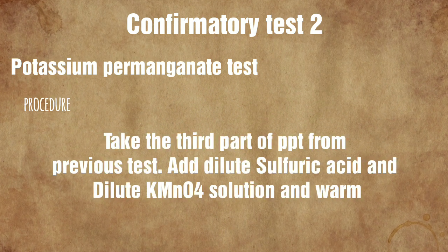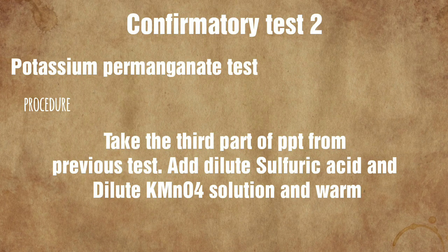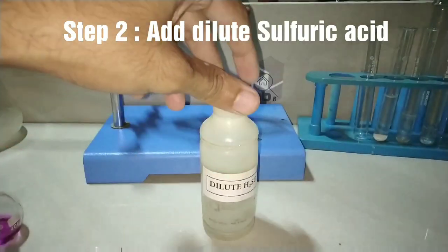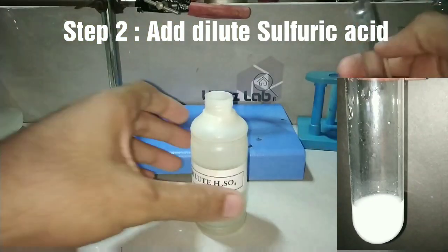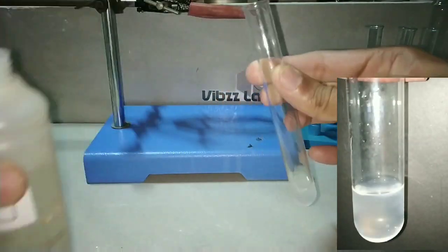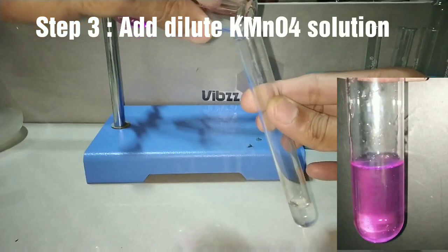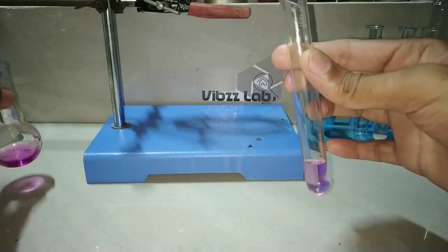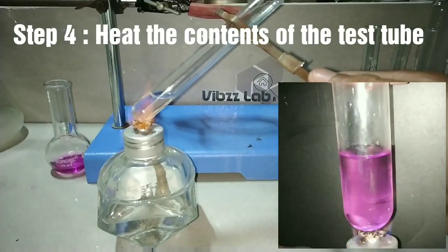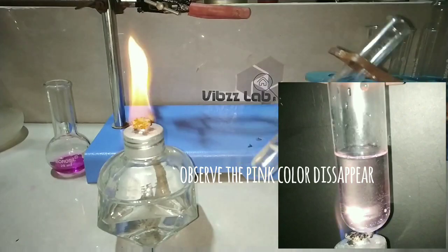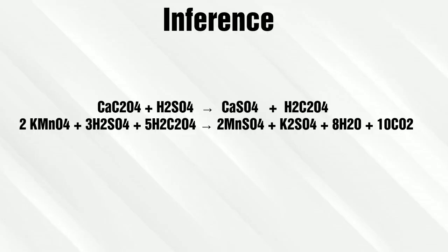The potassium permanganate test: we take the third part of the precipitate from the previous test and add dilute sulfuric acid and dilute potassium permanganate solution, then warm the solution. After adding the dilute sulfuric acid, we add dilute potassium permanganate solution. We are using dilute potassium permanganate here because the color change takes place much faster with small amounts of reactants. On heating, we observe that the pink color is disappearing. Potassium permanganate acts as an oxidizing agent and changes its oxidation state from +7 to +2, thereby decolorizing the solution.